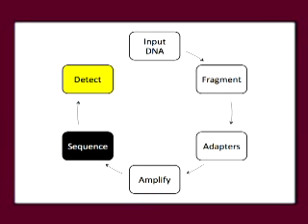This step doesn't involve bacteria like the old sequencing pipeline, just DNA polymerase. At the end, the sequencing reactions are detected by a camera observing a flash of light. In the middle, there are many differences. Let's start by talking about the Illumina technology.